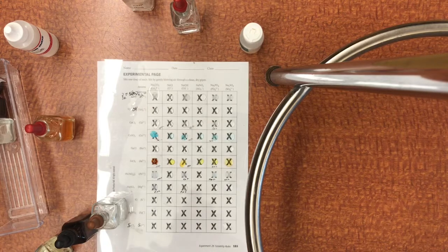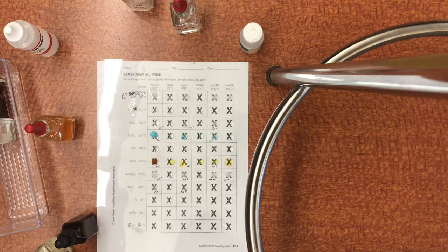If you're a little bit farther into the unit, you'll know that what's happening is we are getting the formation of some equilibria here. So we aren't necessarily expecting a full reaction from all of these things that are considered insoluble. Oh boy, I've got a container with almost no potassium iodide. Oh, there's another one. Okay. So we are seeing almost no reaction in some of these cases.